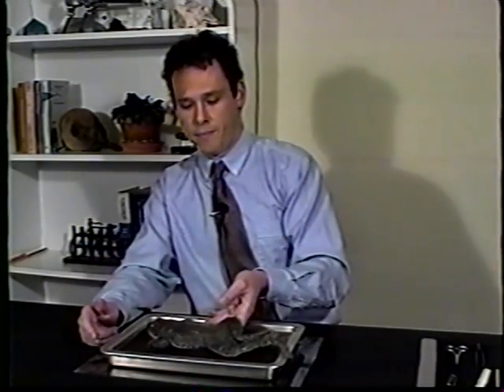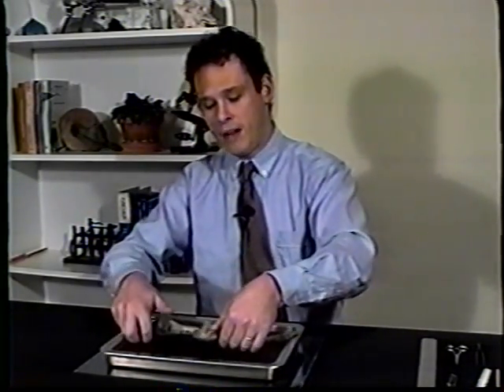Now let's do an external examination of our specimen. While doing this, we want to keep several terms in mind. They are: the anterior end of our specimen is the head end. The posterior end of our specimen is the tail or opposite end. The dorsal side of our specimen is the top or the back side of our frog. And finally, the ventral side of our specimen is the belly or the stomach side.